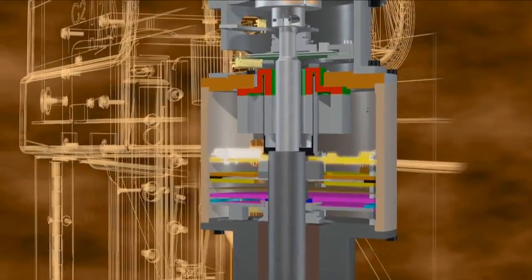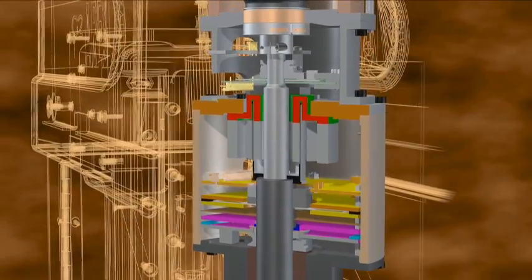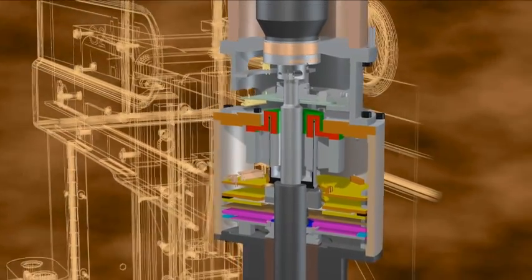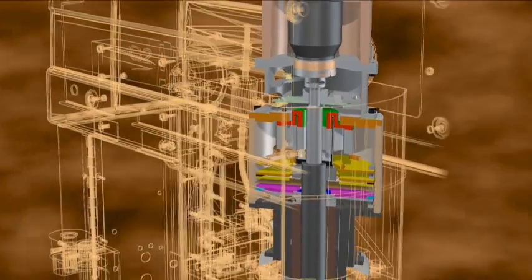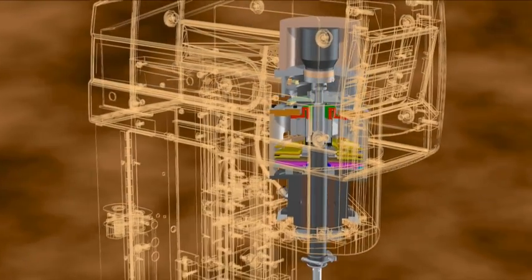A new non-contact upper-temperature sensor completes the transducer. The independent torque measurement eliminates the need to correct for motor friction and inertia, which results in the purest torque measurement.